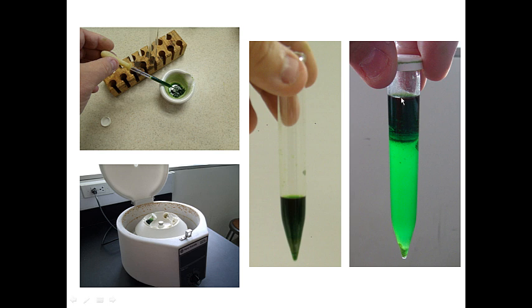You're going to add water and hexanes to this, which will give you 2 layers. And you just put the cap on the centrifuge tube and gently rock it back and forth to do your extraction. We're then going to break the emulsion and get a clean line between the 2 layers by putting it in a centrifuge. When we put these solutions in the centrifuge, we have to make sure that they are counterbalanced. So we have to make sure that there are 2 centrifuge tubes opposite each other as they spin, or else the rotor will wobble and then bad things happen.